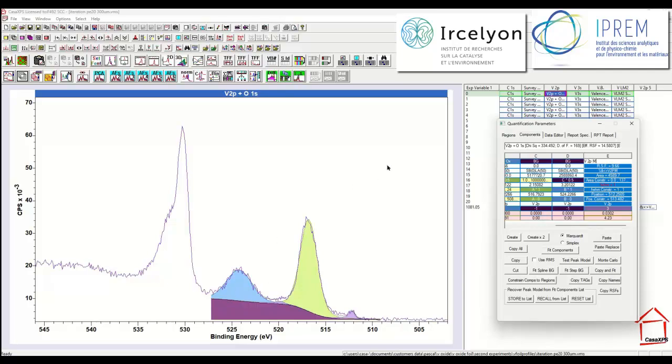So this is a method for trying to reproduce a Shirley background over a limited interval where we perhaps don't have all the data that would be necessary to fit the peak model to the data. Now you may have observed that I have not yet introduced a background component that corresponds to the metallic peak. And this ought to have some bearing on this peak model, and that's because we consider this metal to be a layer beneath the oxide, and as a buried layer you would expect a response in the background that is disproportionate to the amount of signal that we see.